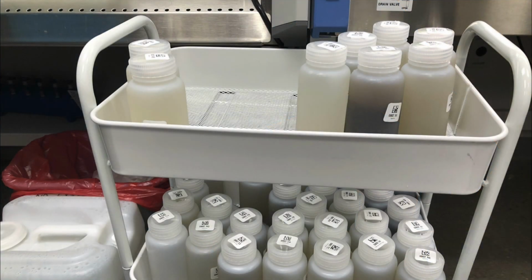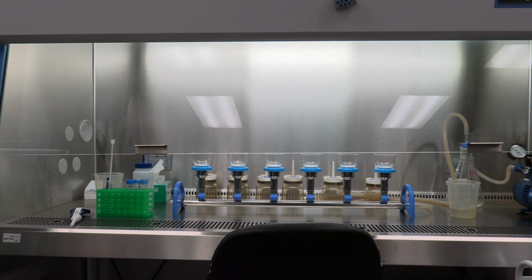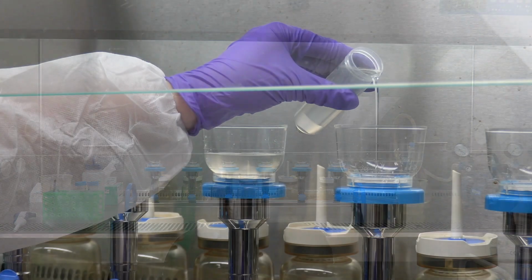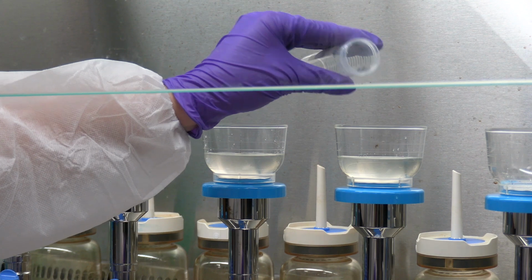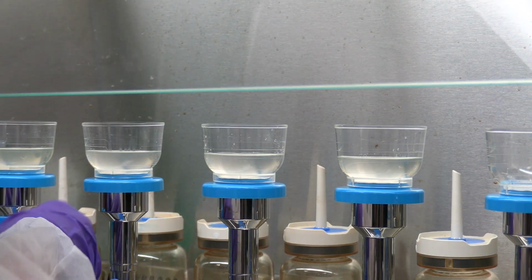Viruses are present at very dilute concentrations in wastewater. There are several different methods that effectively work to concentrate viruses and viral particles in wastewater samples. One method that our team and many other groups use is electronegative membrane filtration. Electronegative membrane filtration with flat or cartridge membrane filters can be used to concentrate viral particles from large volumes of wastewater. It works by binding the viral particles to the membrane filter, usually with the aid of a salt such as magnesium chloride. This method has been effectively used to concentrate SARS-CoV-2 in wastewater.